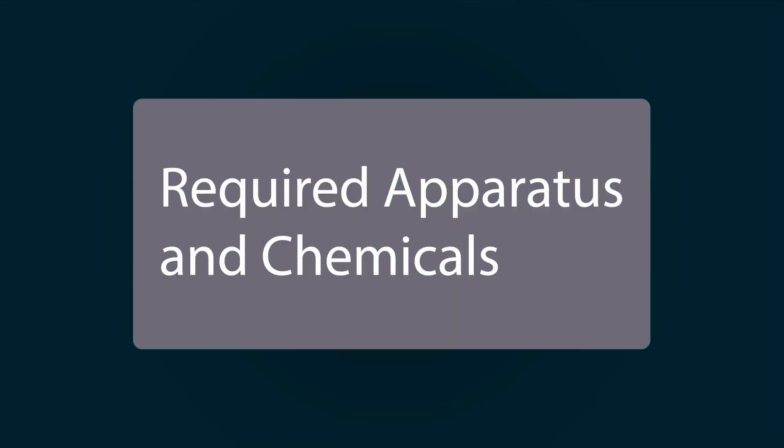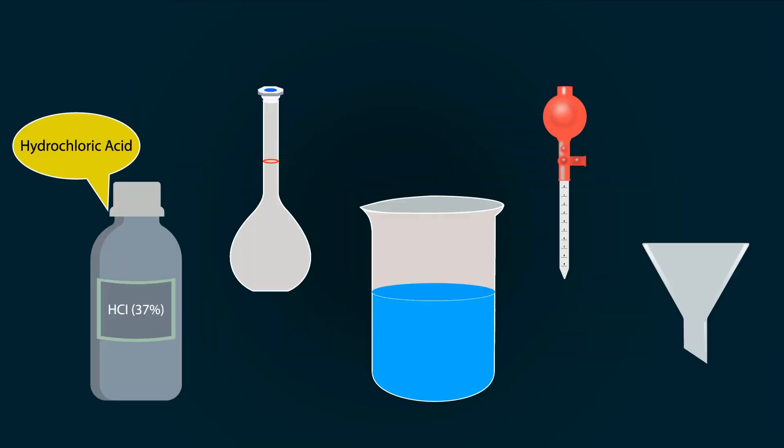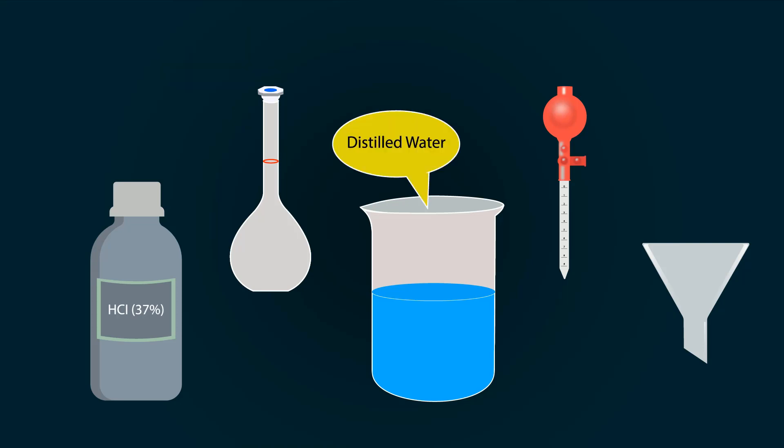The required apparatus and chemicals include hydrochloric acid, a volumetric flask of 500 milliliters, distilled water in a beaker, a pipette, and a funnel.